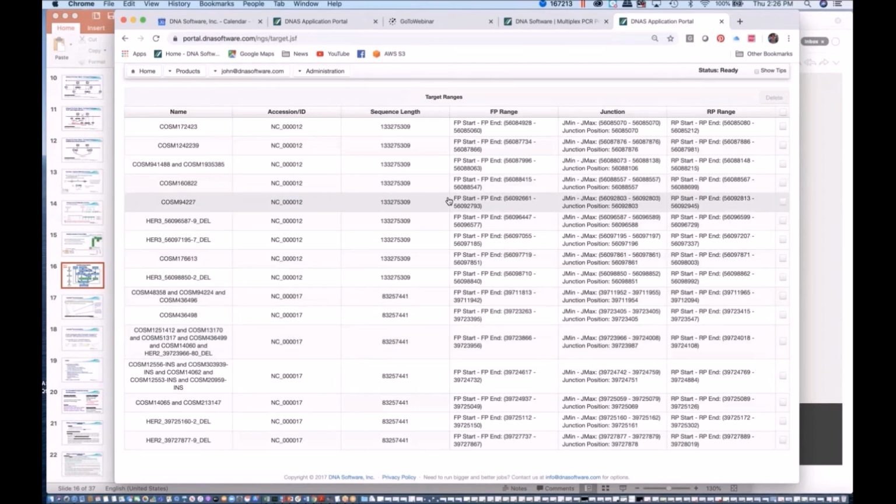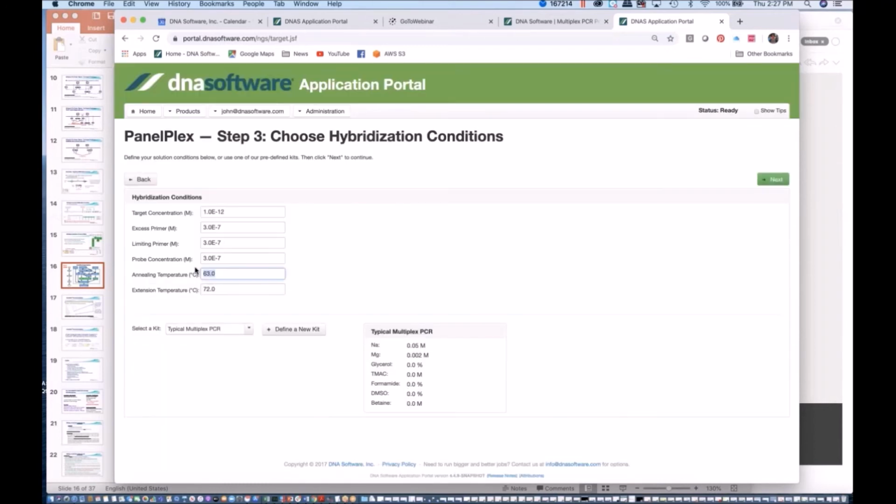So next, just to give you a sense of the default settings we have here for the primer concentration, temperatures, and for the buffer, these are generally applicable. But if you have something in particular, your annealing temperature would be a particular one that folks would design. Maybe they do 60 degrees, some other number. Whatever your assay temperature is, put that in there. That was important. So the primers are designed to work at that 60-degree temperature.